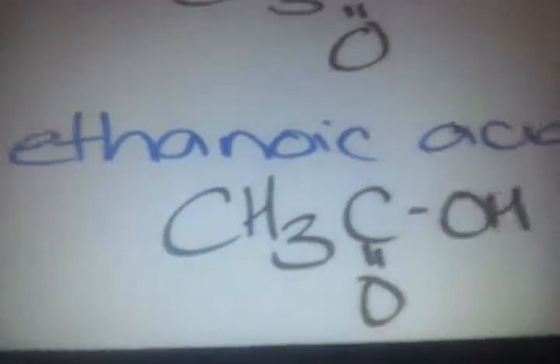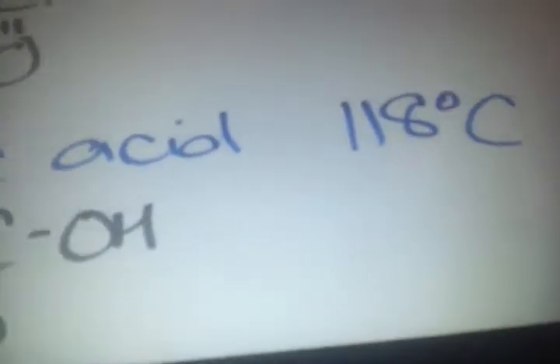So they both use the same ideas of evaporation and condensing, but they use them in different ways. Distillation, when you've got a low boiling point for your desired product. Reflux, which is this one here, when we're after an end product, basically. In this case, it happens to have a very high boiling point.